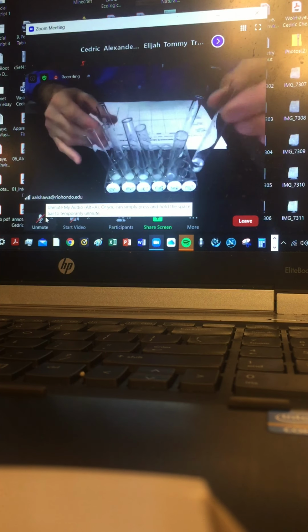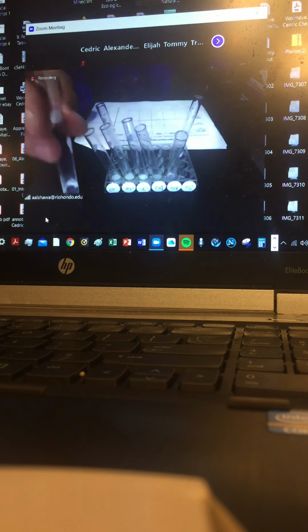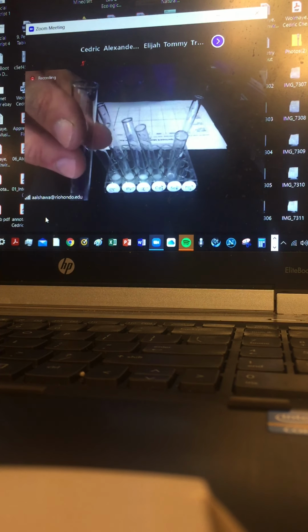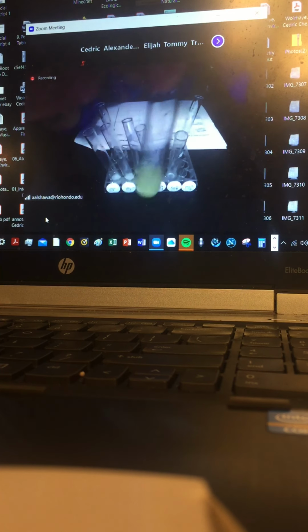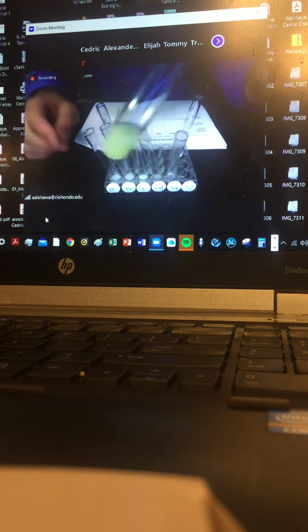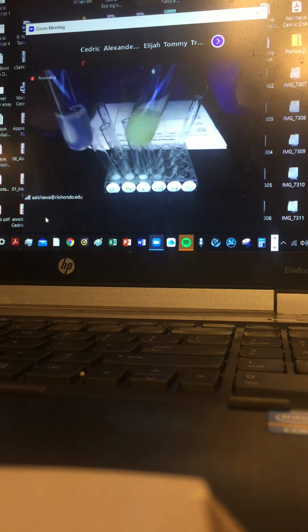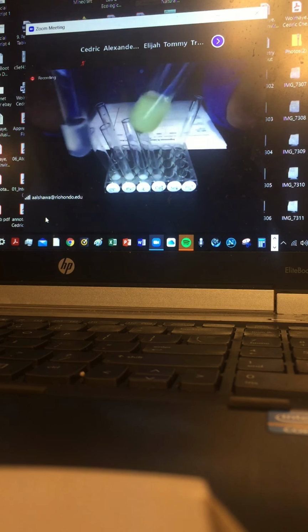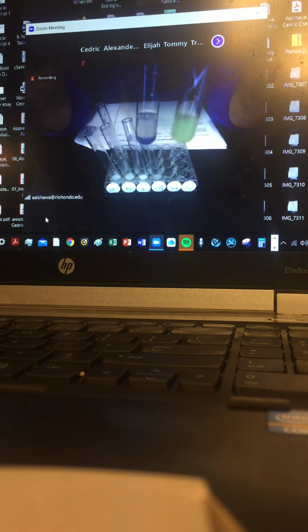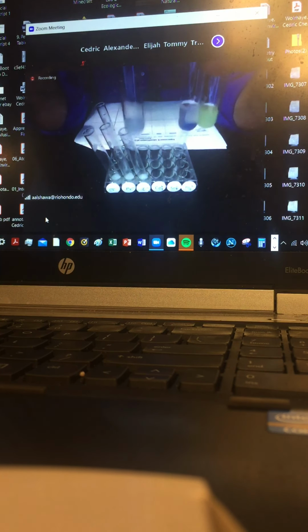All right, so now to the third, the phosphate, I want to add a few drops of silver. Okay, so notice the outcome. Can you see the outcome? So this is the addition of silver nitrate to the sulfate. This is the addition of silver nitrate to the phosphate. These are the polyatomic ion additions. And here is the addition of silver nitrate to the carbonate.